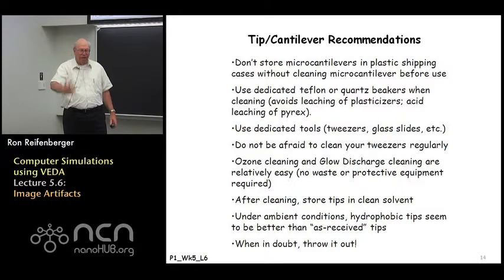There's often questions about the care and handling of tips and cantilevers. I think every lab has developed a procedure that students are encouraged to follow. I just provide a list here of tip cantilever recommendations that we've developed over the years in our scanning probe lab here at Purdue. We really don't like to store these tips in plastic containers. We don't like to clean the tips in plastic beakers. There's all kinds of things that can go wrong with that approach.